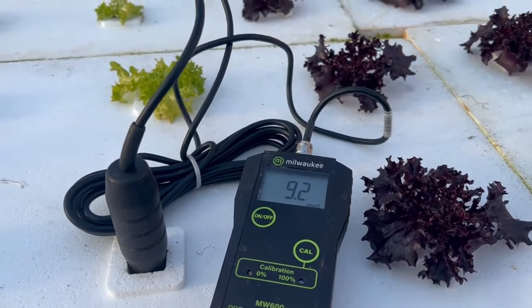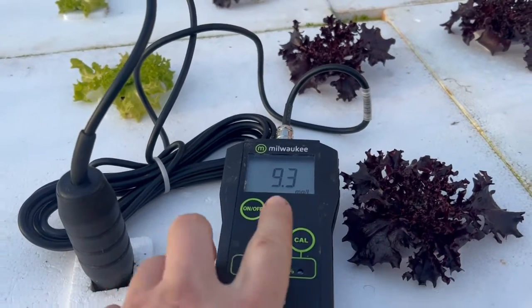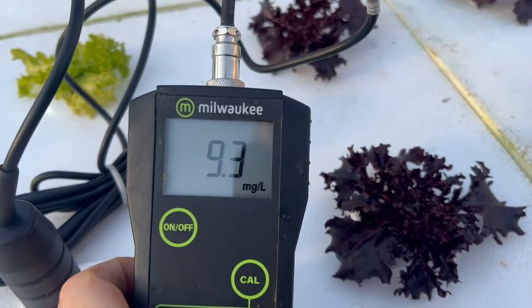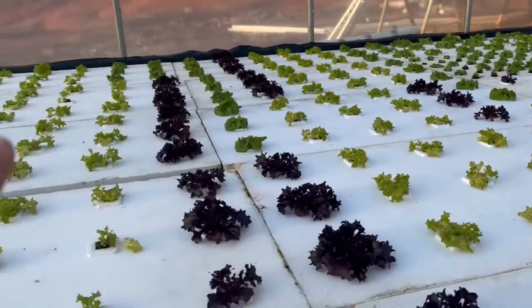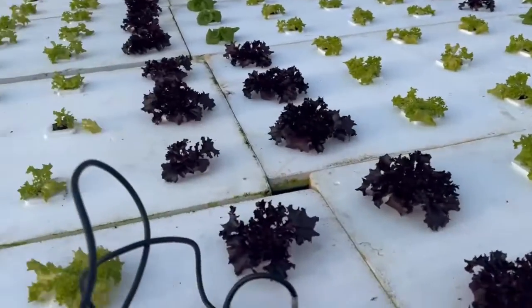It does fluctuate a little bit because I have flowing water going underneath here, but 9.3 is basically how it's reading — so that's parts per million, or milligrams per liter. I'm not too far from the Venturi; it's over there pushing this way and then drawing back this way.